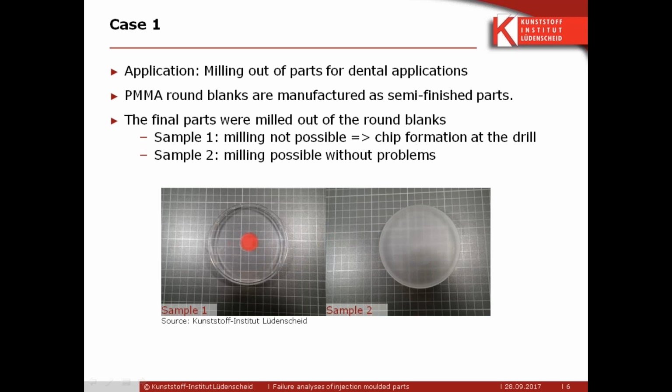You have to notice this x-axis is logarithmic. This means you have a really high average molecular mass for the OK sample, which is higher than something that you can use in an injection mold process.